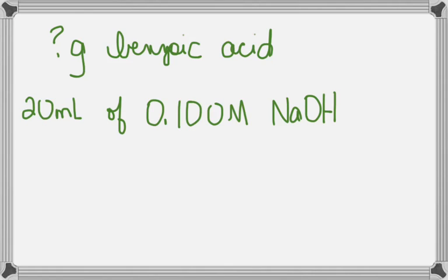So first what we have to do, guys, 20 milliliters of 0.1 molar sodium hydroxide, how many moles of sodium hydroxide is that?